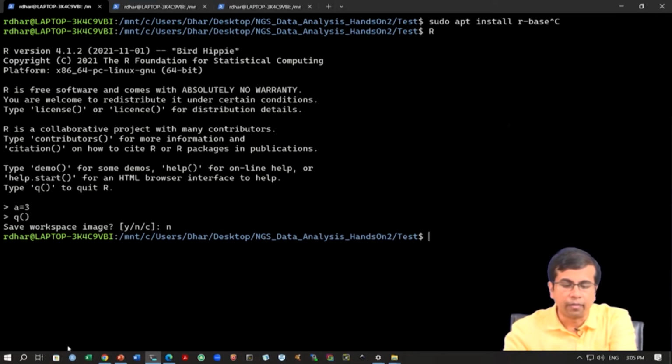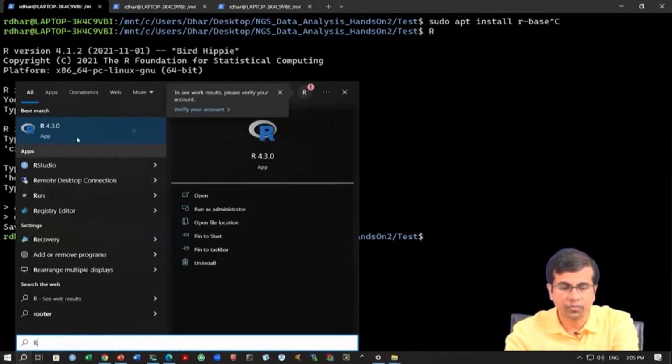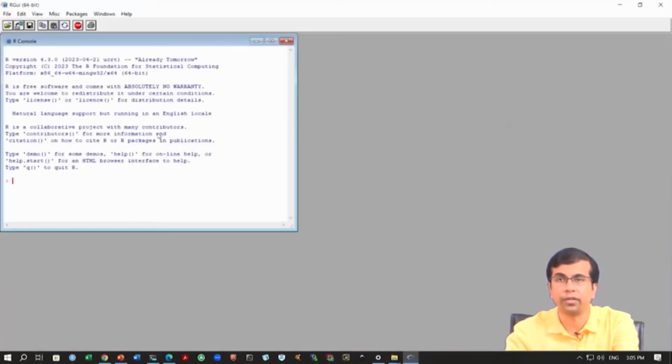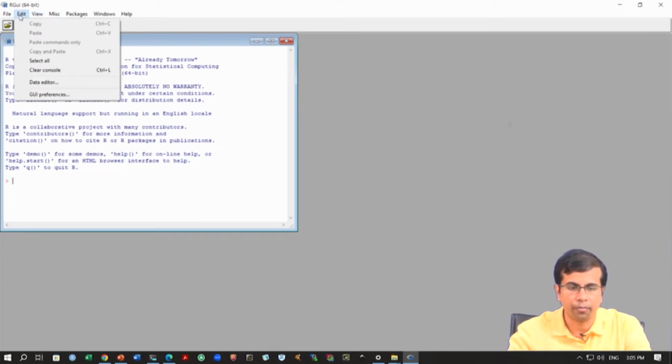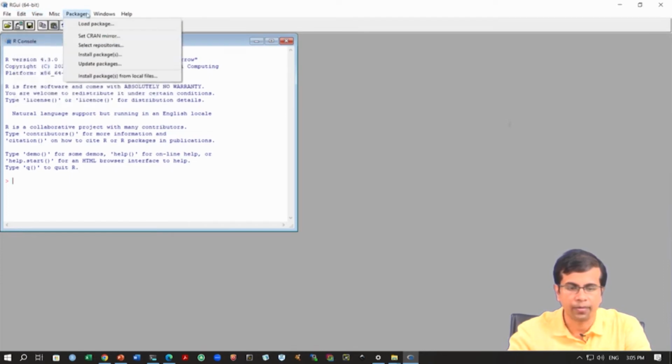Okay. You can also download something called RStudio. I also have this installed here. Okay. So, this is R, I have it installed, this is 4.3.0, and I will run everything from inside here. Okay. I can probably zoom in a bit, let us see.